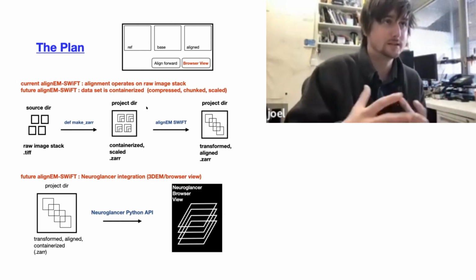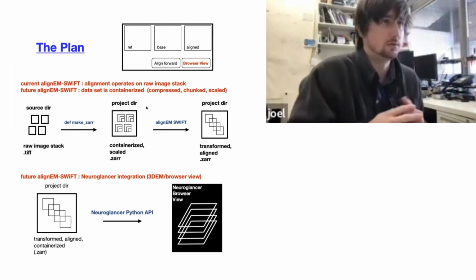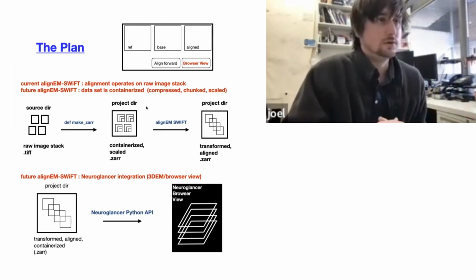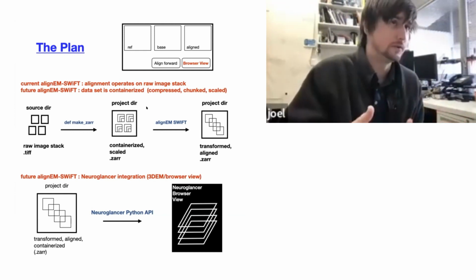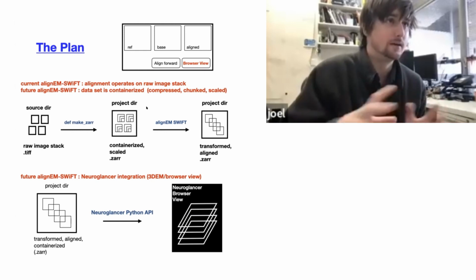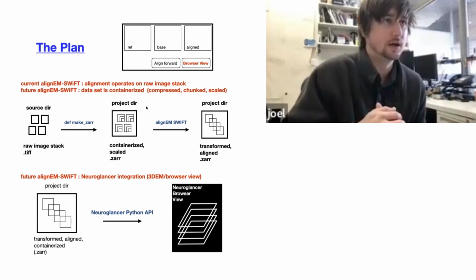It's going to compress based on the compressor that you specify. And we did a little bit of benchmarking that I'll show, on which compressors to use and which one's the fastest. This is benchmarking the read and write performance of writing your images and copying your images into this container.